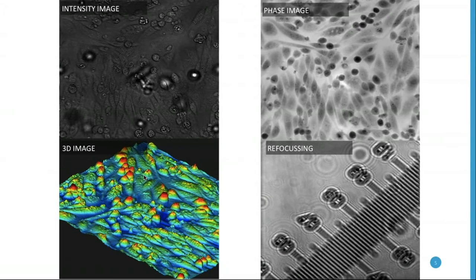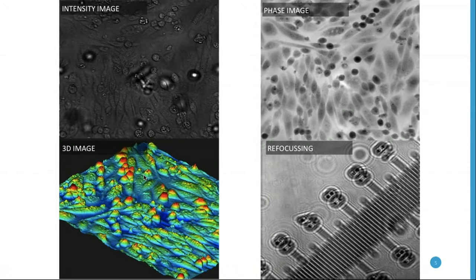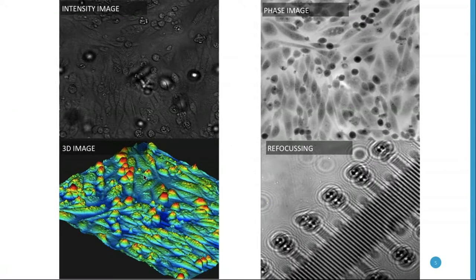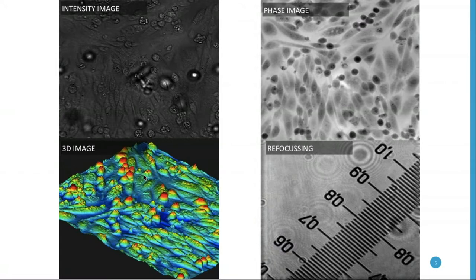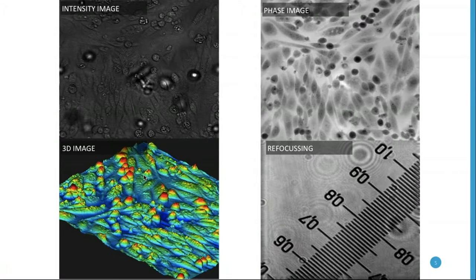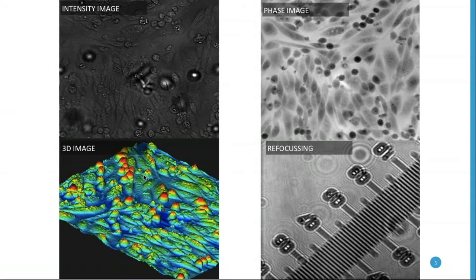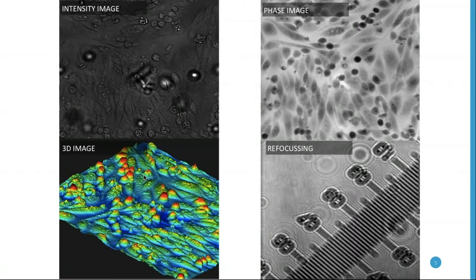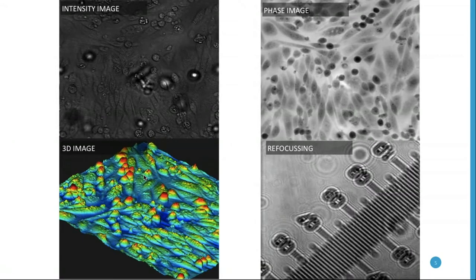For every image we produce, we basically produce three images. The first one is the regular intensity or bright field image. Because we are not using any dyes or reagents, they don't show a lot — you see basic non-dyed cells. Then we have the phase image, which can already tell us more about the cells, their status, size, and shape.